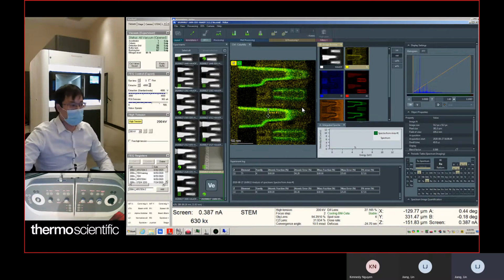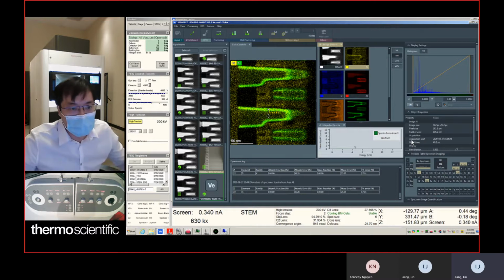At the same time, let me upload the ratio for you. Let's go here. Okay, just downloads. Okay.